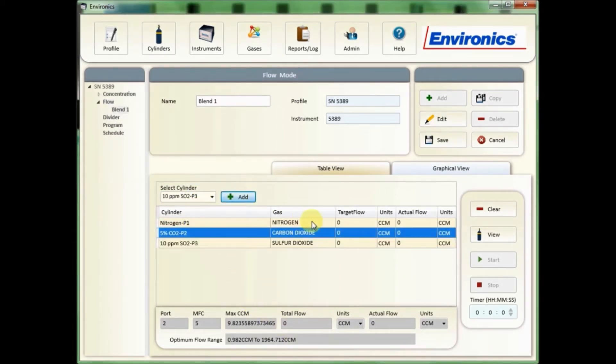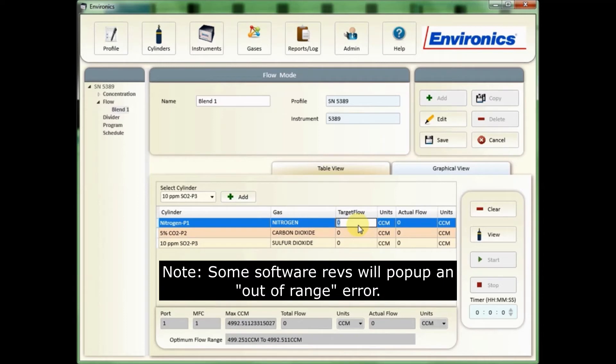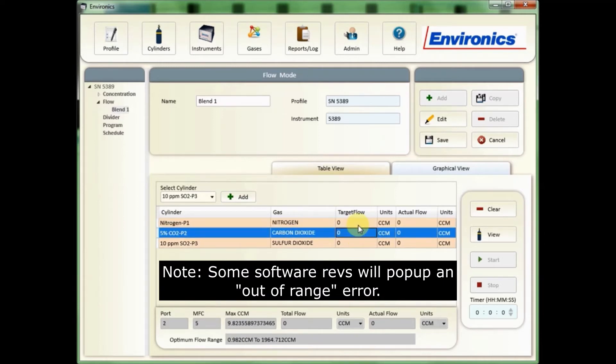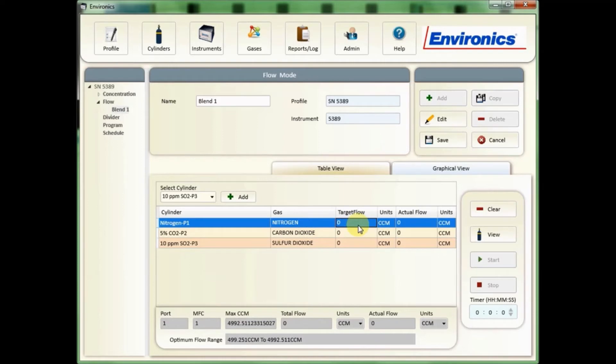Once all the gas cylinders are added to your flow mode, you'll need to add the target flows. In this case my nitrogen flow controller is a five liter, so if I try and put anything above that such as six liters, it's going to not let me do that - it's going to default back to zero. So let's put this at 5,000 cc's.